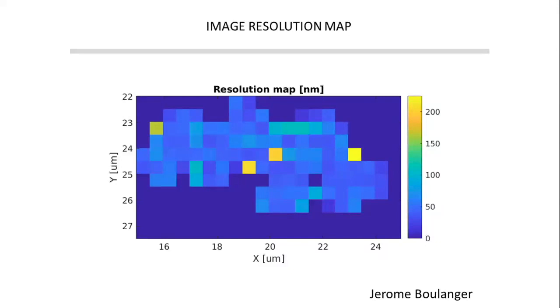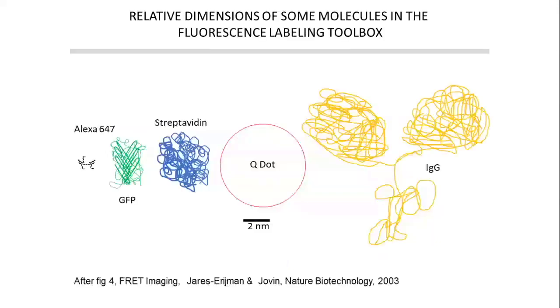The other thing to consider is our labels. Most of what we've been doing so far is all antibody labels. So we have this toolbox of fluorescent stuff, antibodies. Well, structural biology has come on a bit since that squiggle that I did there, but they're pretty big, right? They are of themselves a good 10 nanometers in diameter. So if we're attaching one of these onto our protein of interest, we're sort of adding a 10 nanometer spacer onto it.